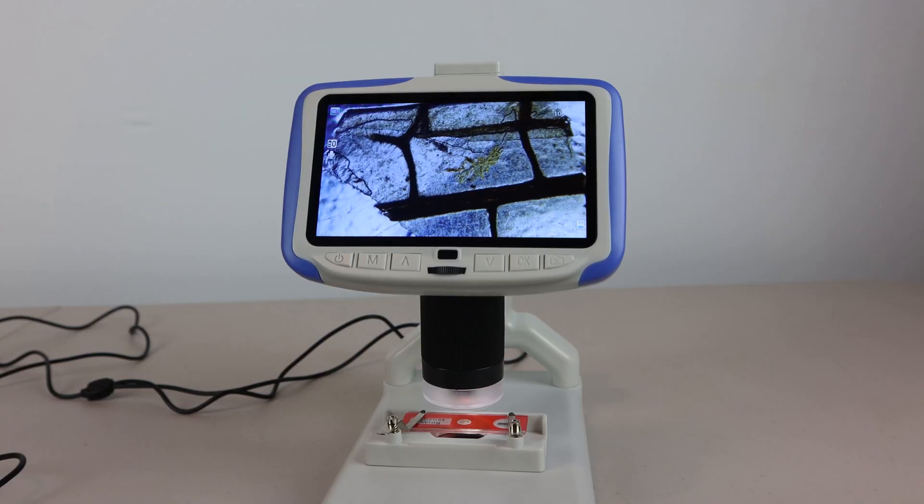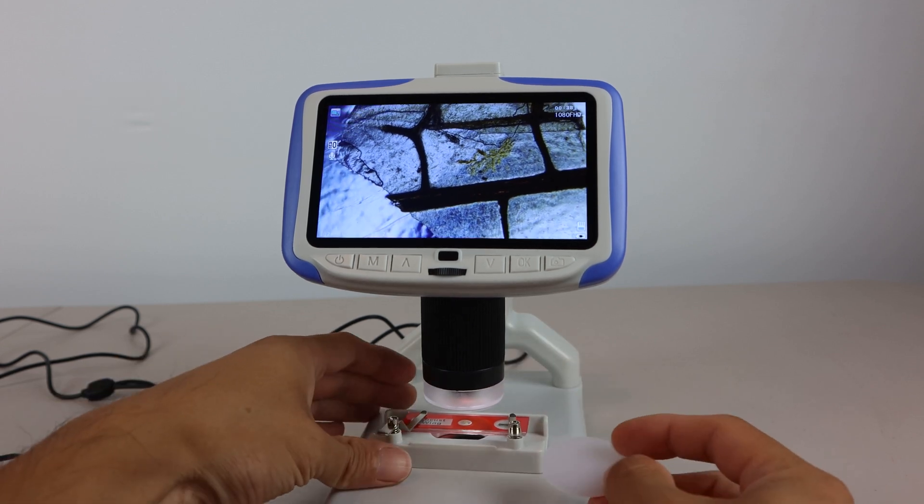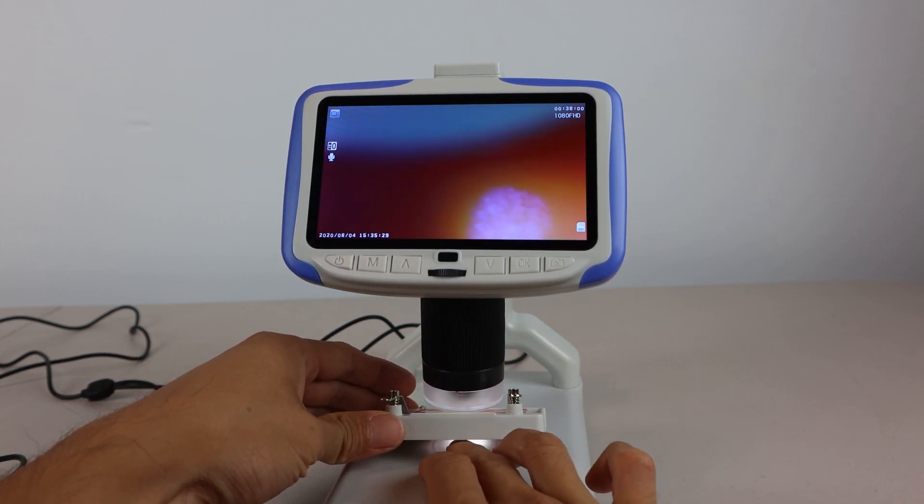So far, we've been viewing the samples without a light filter. But let's try installing the translucent light filter and see how that changes the image.